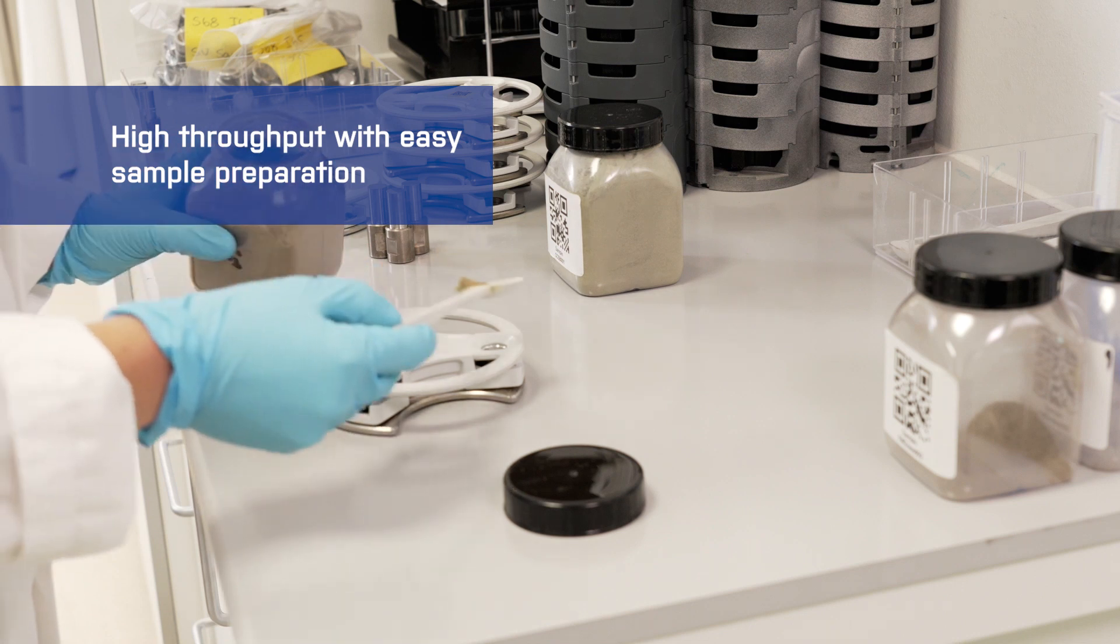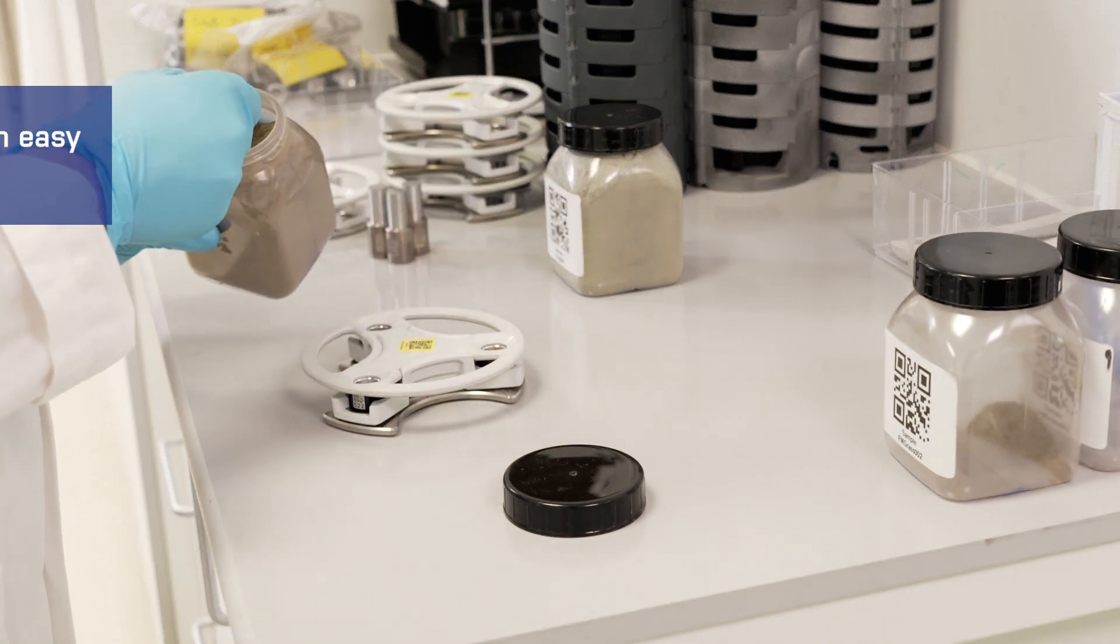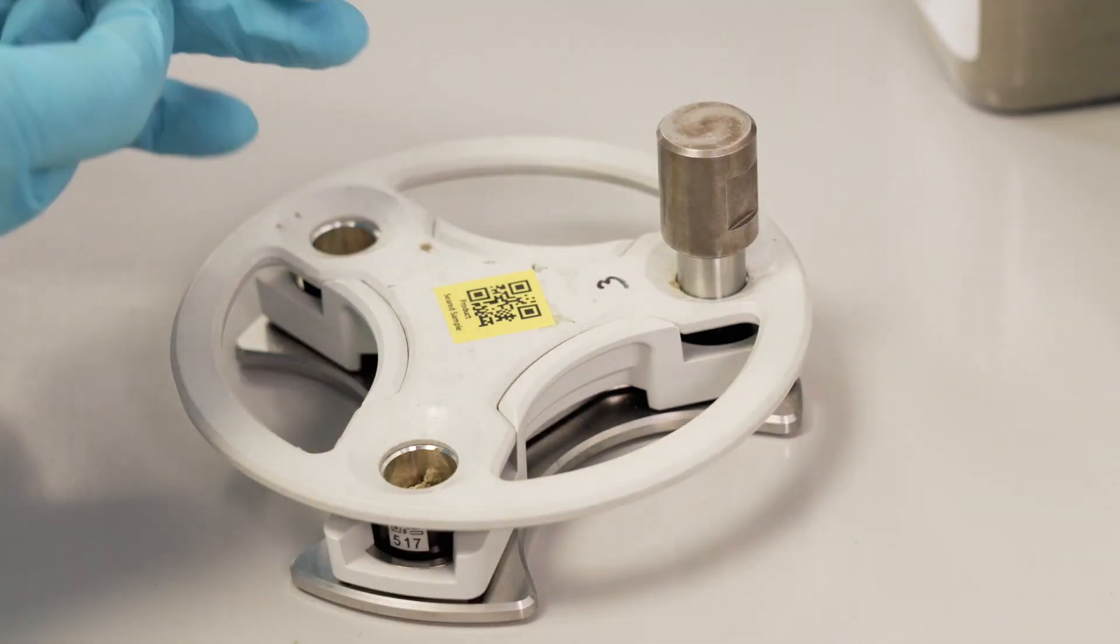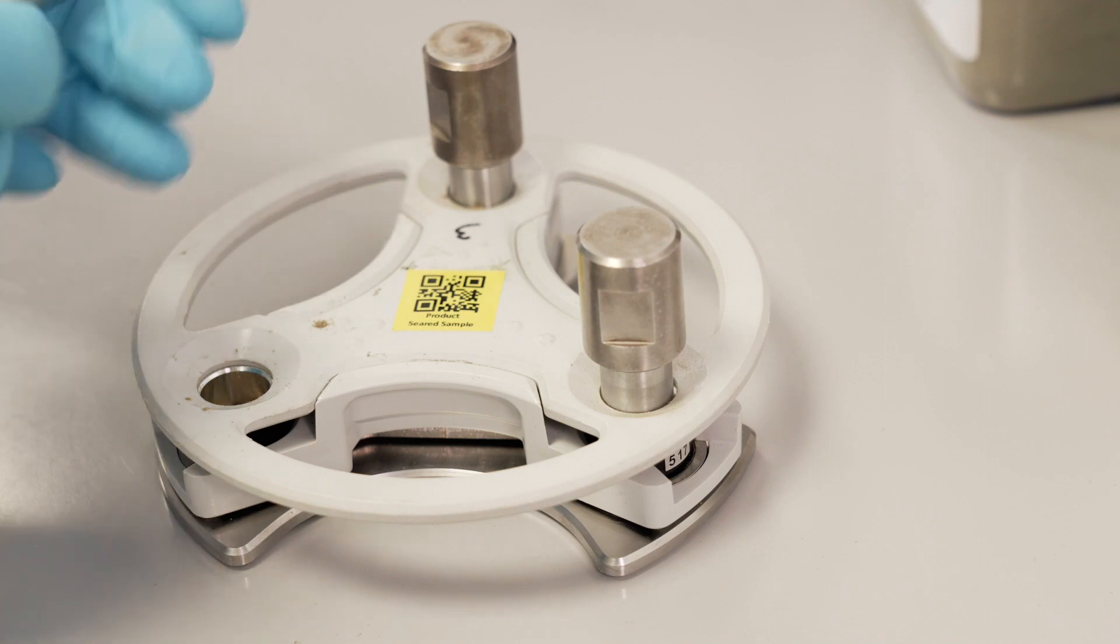The sample material is scooped into the sample containers. A press shaft is inserted into each sample container.